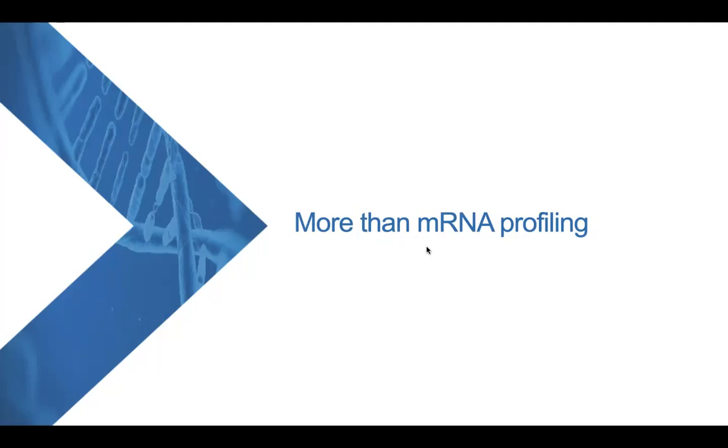RNA integrity and the output content. So I can share this information with you later on. I don't have the slides on the RNA-specific, plant-specific data in my current presentation, but this is something that we can share with you. And another question is whether we have machine learning algorithms to annotate the cell types.